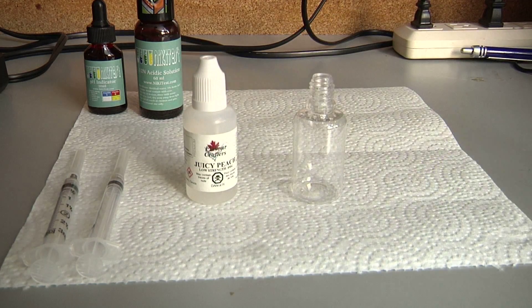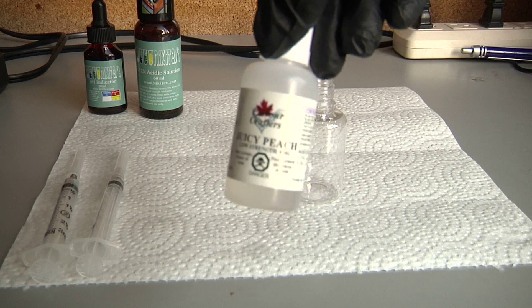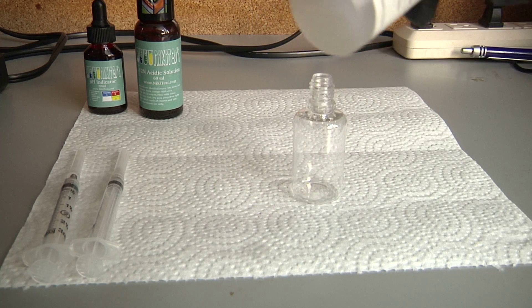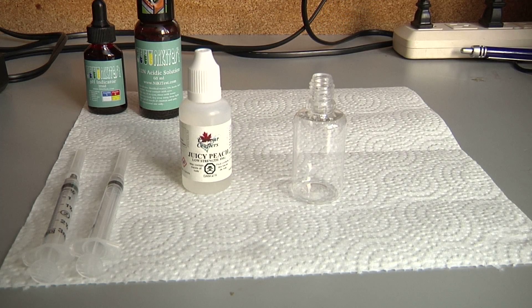Step three is where we start the test, and I will be using some Juicy Peach from Flavor Crafters — it's supposed to be 8 milligrams, so we're going to find out if it's actually 8 milligrams. This is a very clear liquid; I chose that specifically. Colored liquids can apparently produce accurate results but I think it'll be a lot easier to show you with a clear e-liquid.